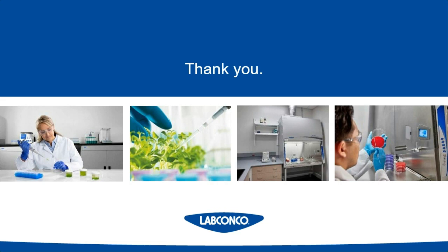So you maybe have 1 or 2 cabinets in there and a couple incubators and maybe a counter and a sink. Now, depending on how many air changes per hour your HVAC system has in that room, the B2 cabinet is going to exhaust a large volume of air. It might be the case that your HVAC system cannot keep up with those cabinets. In that case, a C1 would be a good recommendation because its exhaust volumes are a lot lower and it still provides you with that 100% exhaust in that chemical work area.